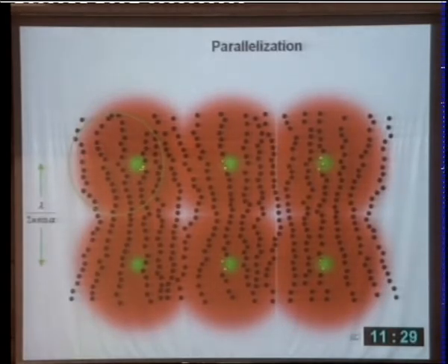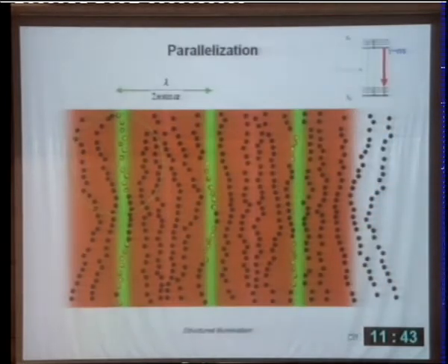We don't have to worry that the signal from here is confounded with that from here, because it's further away than Abbe's diffraction barrier. So we need for the 200 nanometer zone only one, say, donut, so to speak. They are sparse enough in order to be separated. The separation has to happen within a 200 nanometer range.